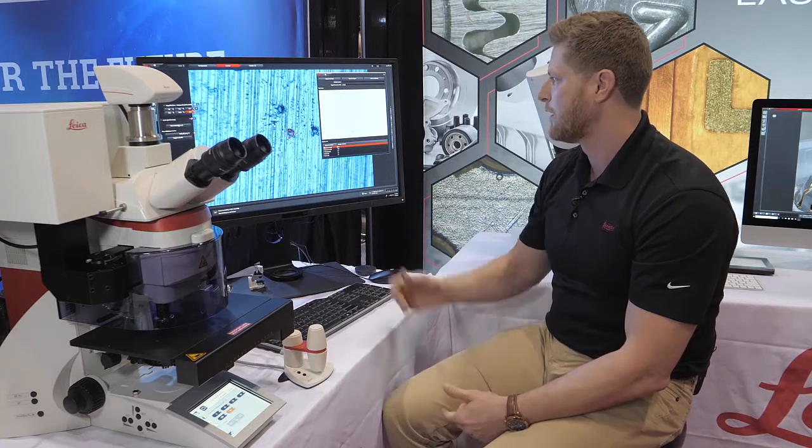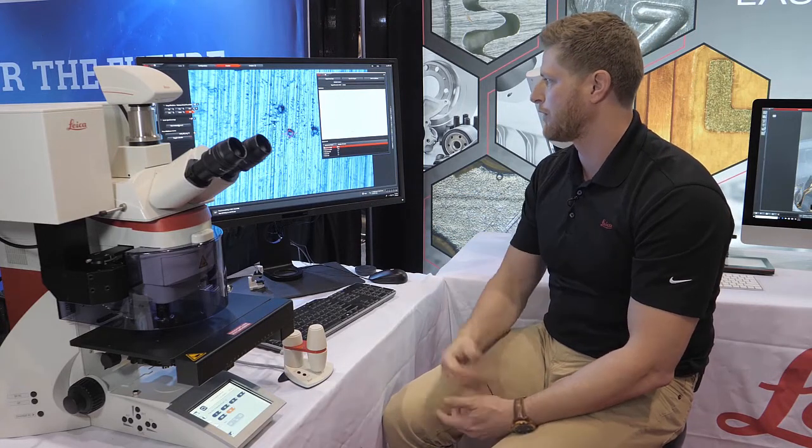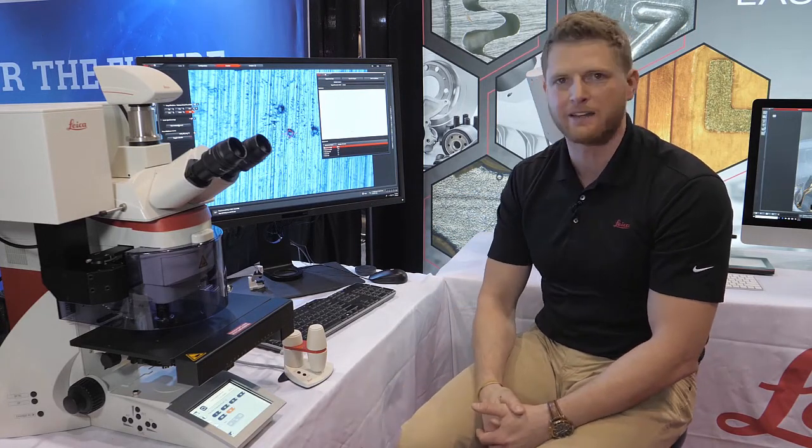So you can see in this particular case our sample is aluminum with traces of chromium and titanium and platinum.